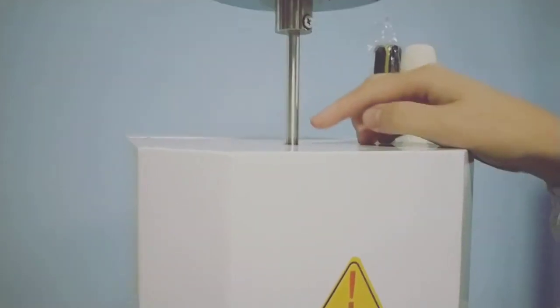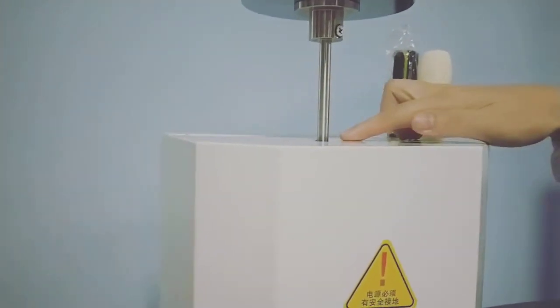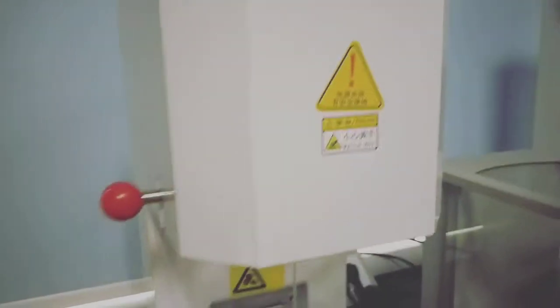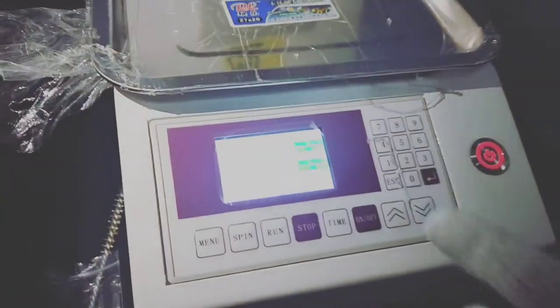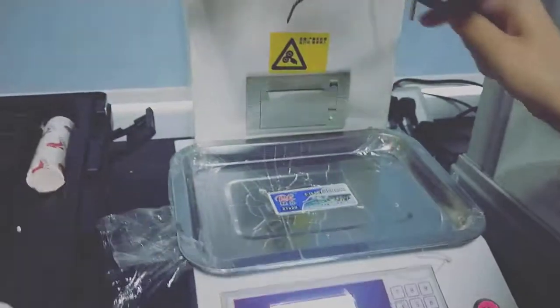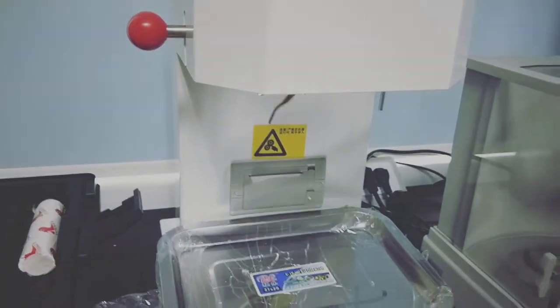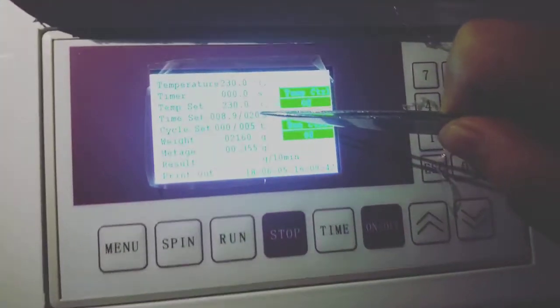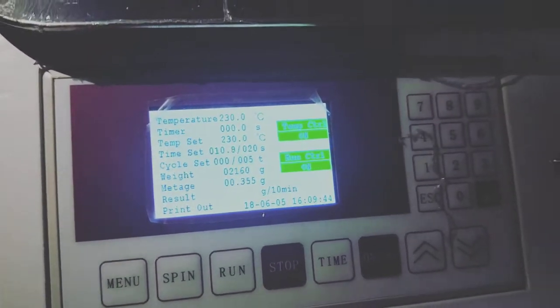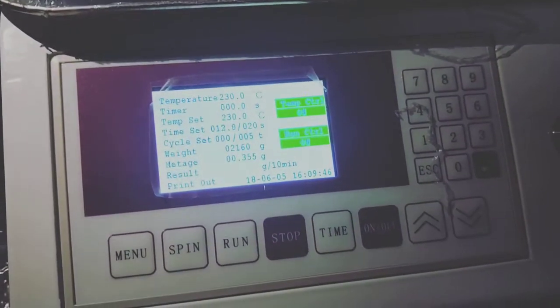Then we do not wait. When the curve is equal to this space, then we press run key. It will automatically cut. And this piece we do not use. Then we can see the time is calculated. After 20 seconds, it will automatically cut one piece.